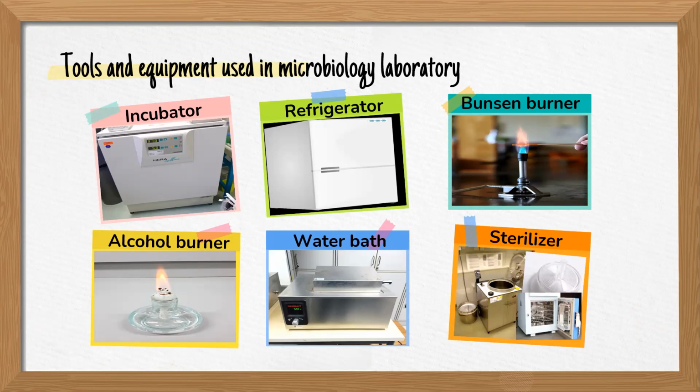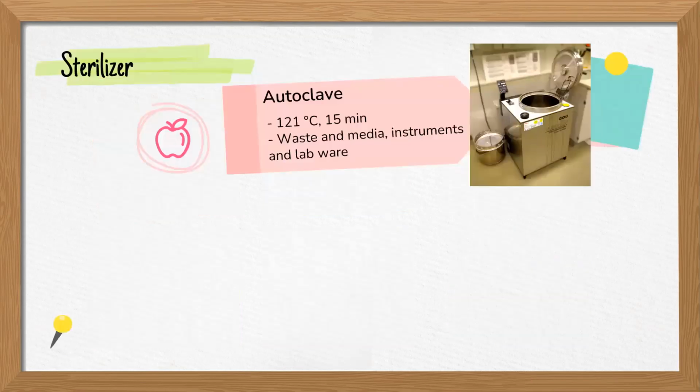Sterilizer. It is used to remove all living things from the culture medium, as well as tools and various equipment. The methods for destroying or eliminating microorganisms and other living things are called sterilization, which has many forms, but the equipment used should be selected to suit the type of work. Here are examples of sterilizers.